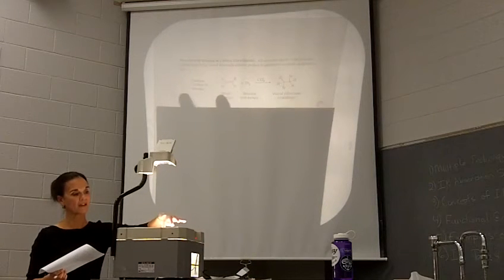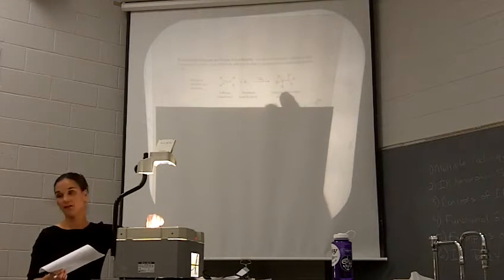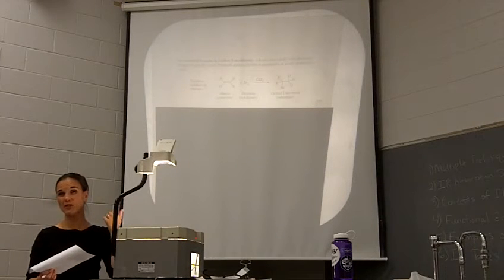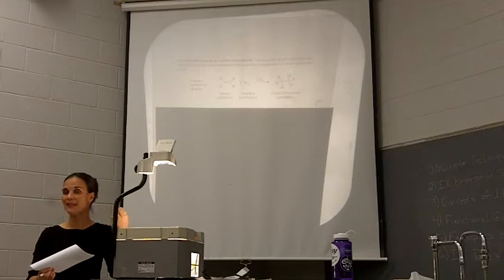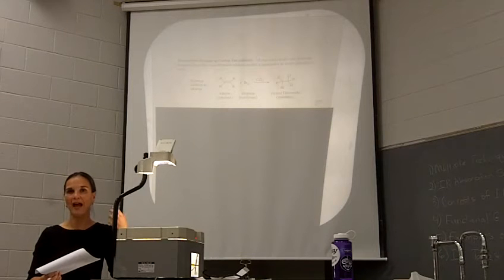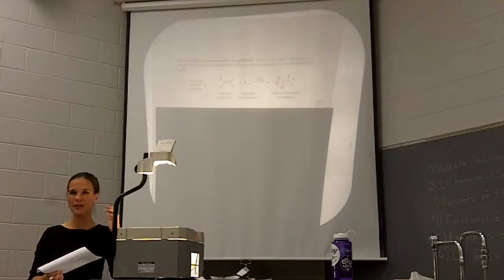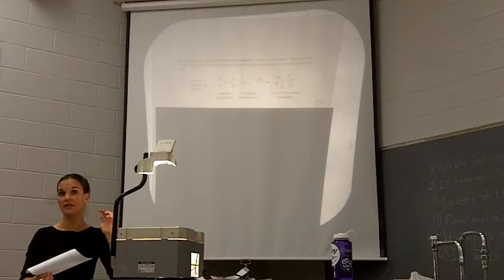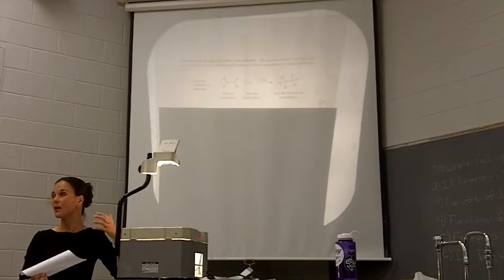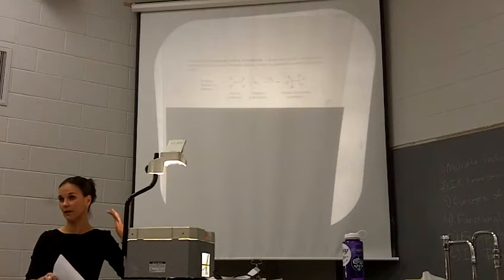If you have an alkene and add bromine to it, it reacts to give the dibromide, which is colorless, okay? What you're doing is counting how many drops until you get that bromine color to persist, because the bromine color will persist when you've run out of alkene to react with it. When there's nothing left to react with, it's going to turn orange. When you get to like 20, 30 drops, that's enough bromine. You don't need to keep adding it until the bromine color persists. If you've added 20 to 30 drops, you could consider that potentially a positive for your bromine test, okay?